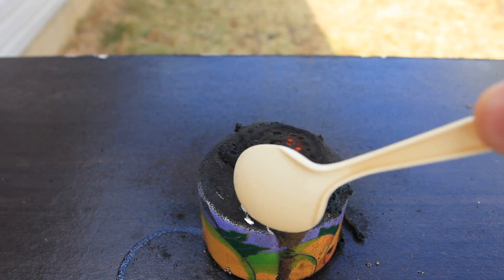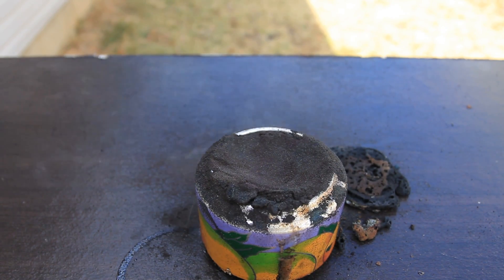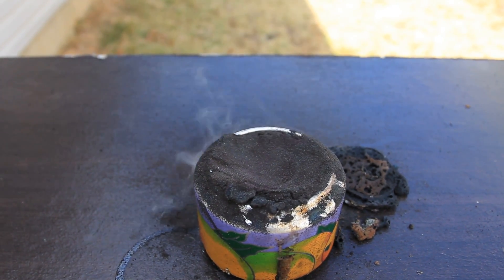Pretty crazy, huh? So, we got this ash over here left. Let's try this again. You see, you don't really need a lot of potassium.